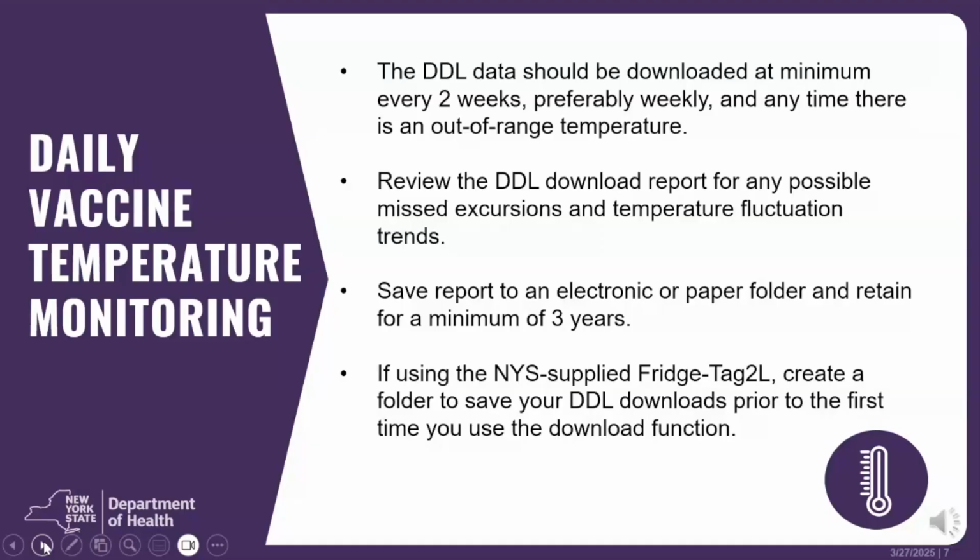The downloaded reports must be stored in an electronic or paper folder and maintained for a minimum of 3 years as required by the CDC. The reports must be made available upon request. If you are using the New York State supplied Fridge-tag 2L, it is recommended that you create a folder to save your DDL downloads prior to the first time you use the download function.